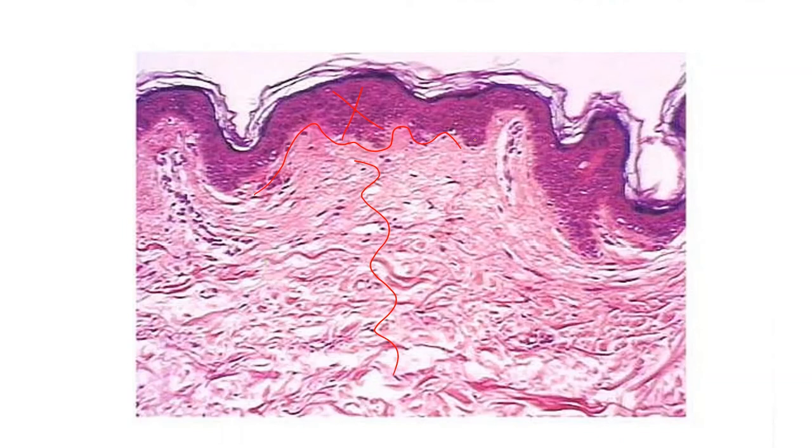It looks kind of marbled to me, like it's marbling. We got collagenous fibers, but they're running in all kinds of directions. So this would be called dense, irregular connective tissue. Dense, irregular. It's going to provide strength and support, but in multiple directions. Location, something like a fibrous joint capsule where we need to resist pull in all directions.